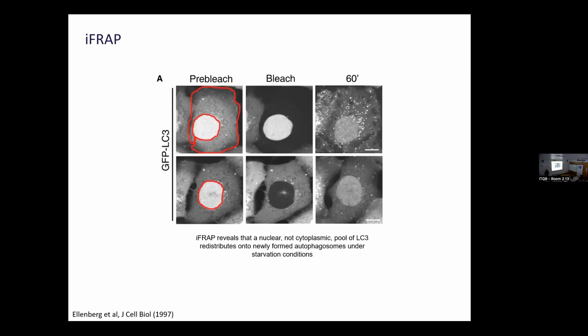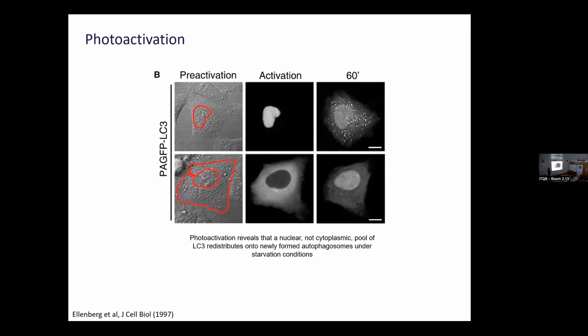The same thing can be done with photoactivation, and you know that we have fluorescent proteins, but we also have photoactivatable proteins, like photoactivatable GFP that is dark until you illuminate it with violet light, and then it becomes like a normal GFP. Or Dendra that is green, you excite with violet, and it becomes red. So you can also use this optical highlighting technique to do the inverse of FRAP. Instead of bleaching, you can activate and then look at the dynamics over time. All good?